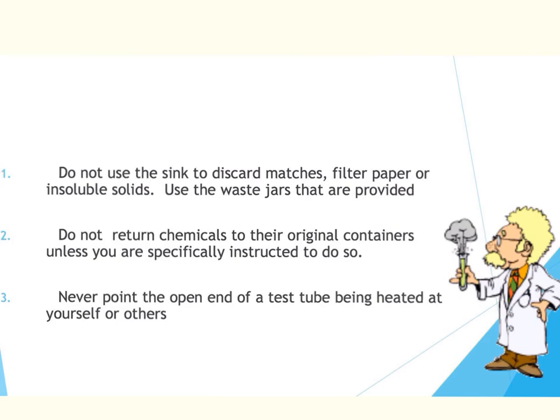Another pet peeve is using the sink as a trash can. Please make sure that you do not use the sink to discard matches, filter paper, or any kind of insoluble solids. I will have waste jars available. When you use chemicals, if you have any extras, do not return those to the original container unless I tell you to. I will have special containers for you to put that unused material.